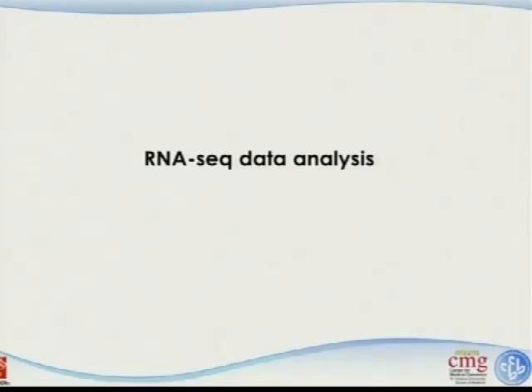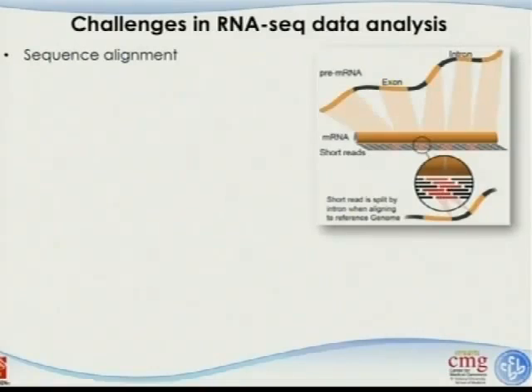So there are a lot of very creative RNA sequencing applications, and I think you really need to use this technology creatively to help your research, not only for routine analysis. Okay? So now I'm going to switch gears a little bit and really talk about the data analysis part.